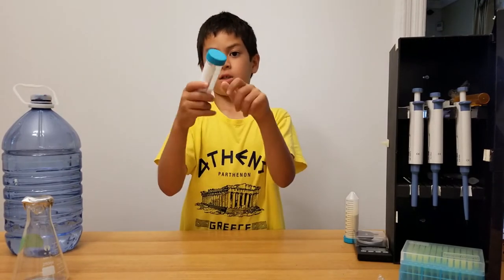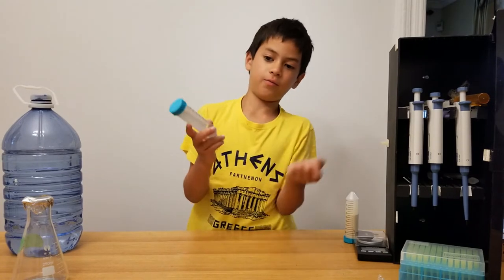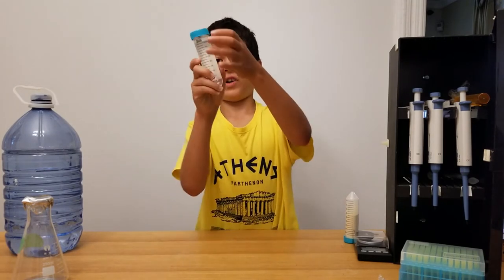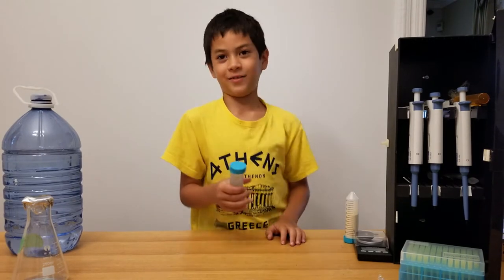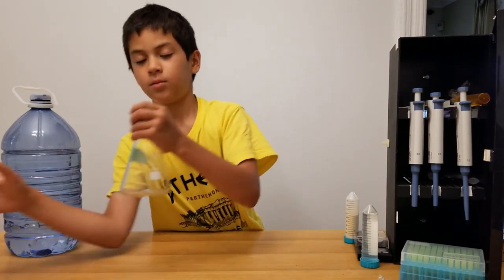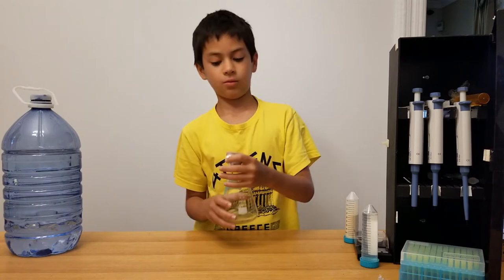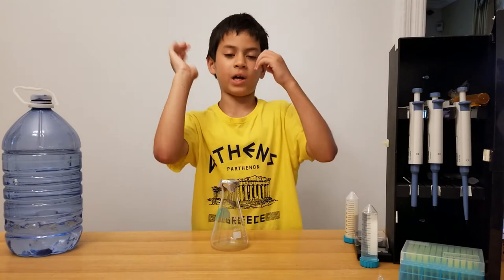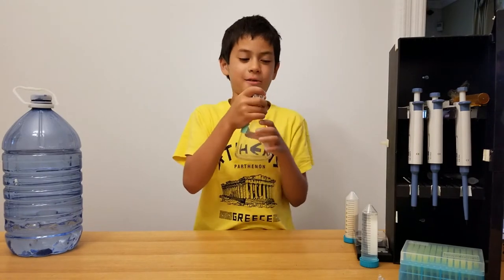We're gonna use still water, which we put into one of these tubes — the kind that shows you the volume, around fifty milliliters. We fill it to the top. Now we're also gonna use a flask, because we're going to put all the food in the microwave.